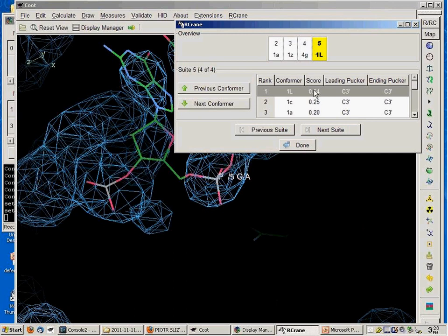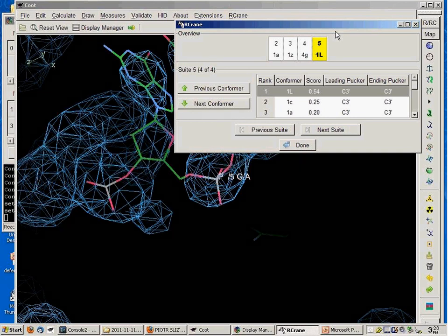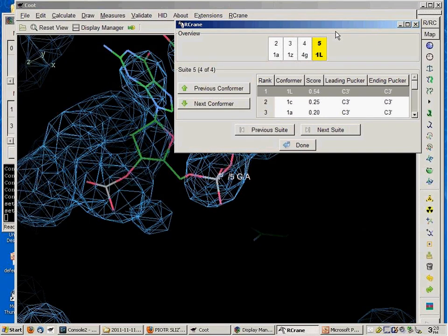You may also get something colored in if coordinate calculation couldn't find a good set of coordinates that matched both the predicted conformer and the phosphate and base coordinates. So you may have angles wrong in the backbone, or some bond lengths that are a little bit off. Basically, if the structure looks wrong, you can try an alternate conformer. And very often, it typically means that something went wrong in your tracing. You have either a base or a phosphate that's very far out, but that's flagged for you.